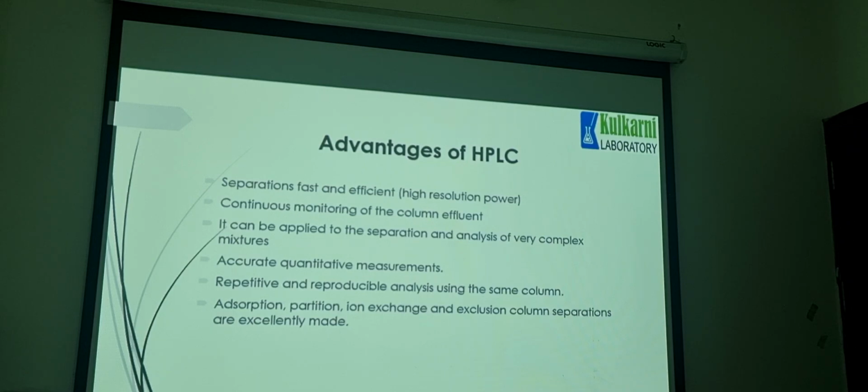So there are some advantages of HPLC. Separation is fast and efficient, that is high resolution power. Continuous monitoring of the column effluent. It can be applied to the separation and analysis of very complex mixtures. Then accurate quantitative measurements, repetitive and reproducible analysis using the same column.